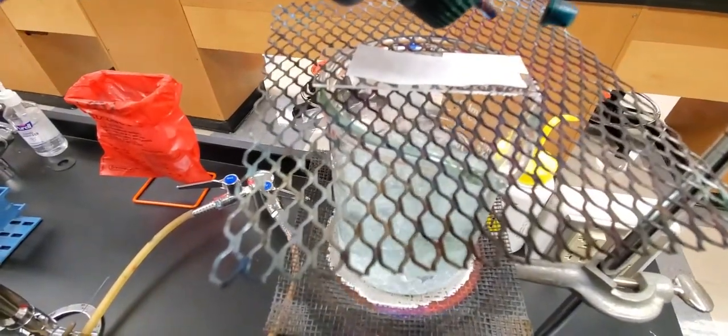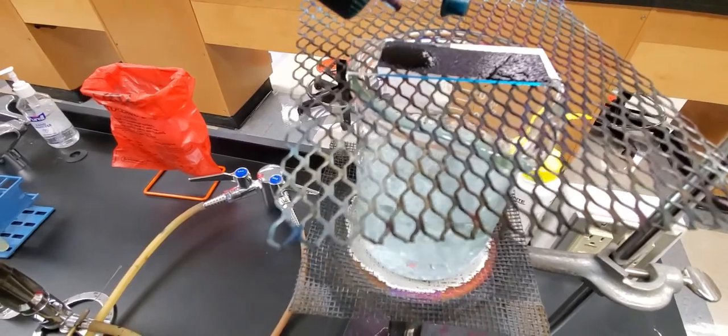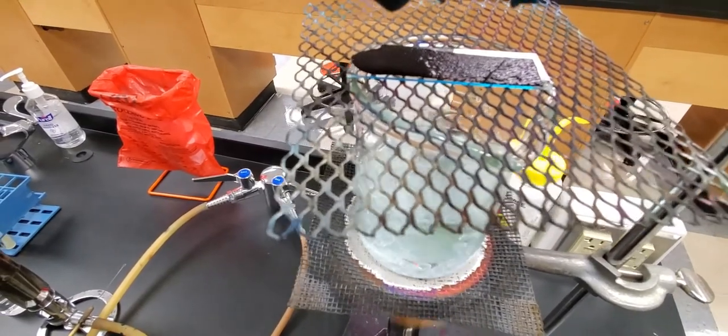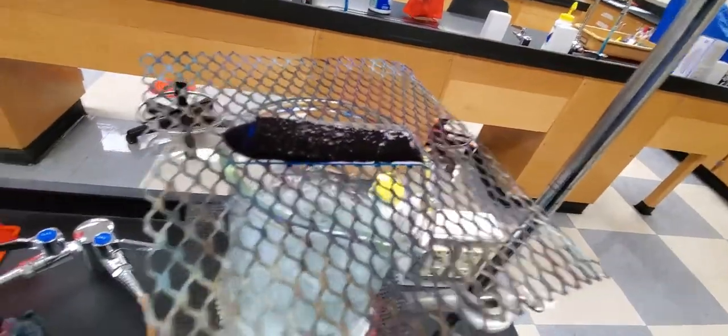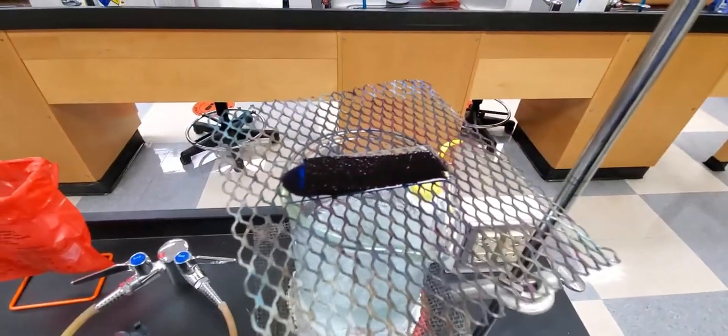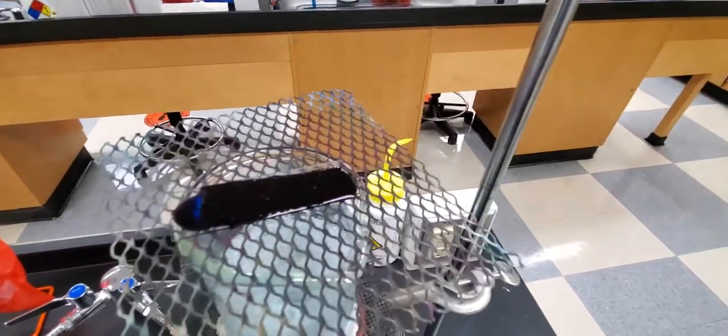This is just going to be there to help keep the stain from traveling too far off the slide, and it's also going to hold it down on the surface. We'll let it sit here for a good five to ten minutes, and that will give a chance for the stain to actually penetrate into the spore coating.